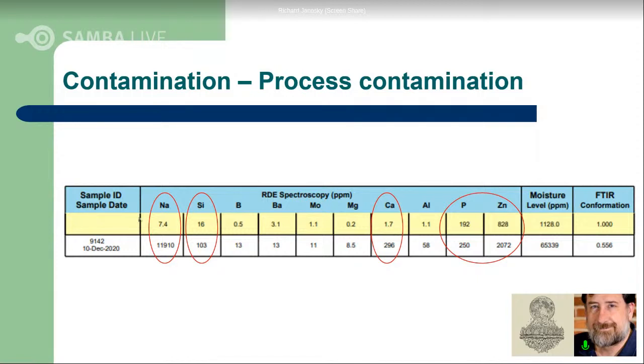Dave Turner was talking about ratios in the sidebar conversation earlier with respect to what's in some clay thickened greases. But if we know what's in the environment surrounding the equipment, what kind of elements are present, and what ratios they're there in, it becomes a trigger point for us to say, this is a contamination issue. We know where it's coming from, and it corresponds to the environment this is working in.